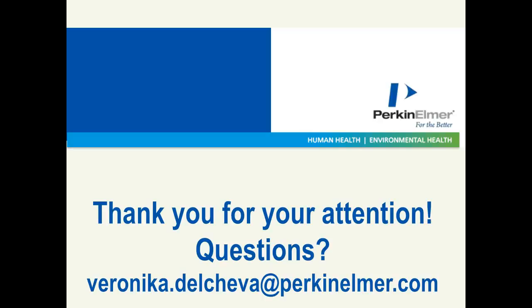Although again, you still need some charge to separate. It will be more like a gel filtration thing, which you can do. But again, for the native, it depends on the charges. I'm not sure whether this is possible with this, but as far as I know, not now. Yeah, maybe in the future it would come something like that. It will be really nice because it will be in a small scale. It will be very great.